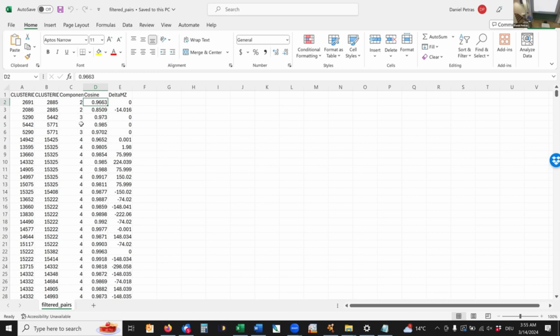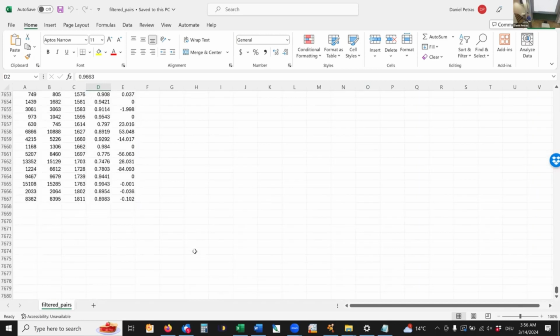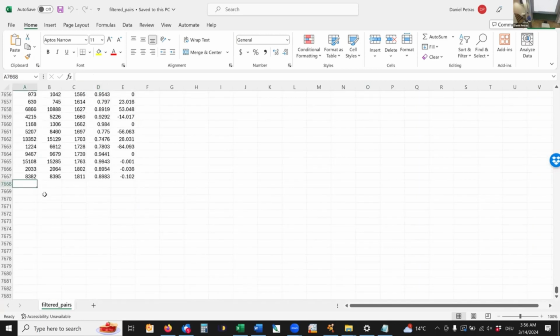And then what we did at the beginning was we would basically scroll to the end of this table and then add new connections in there, right? And then just say, well, instead of here network node 1 and network node 2 correlate, we would create a new column and call this an IIN edge and then provide the Pearson correlation score or whatnot, right? And that way you can expand this by yourself. Now, if you want to display correlations to an ASV, you could also add this to this table and then bring it into Cytoscape.